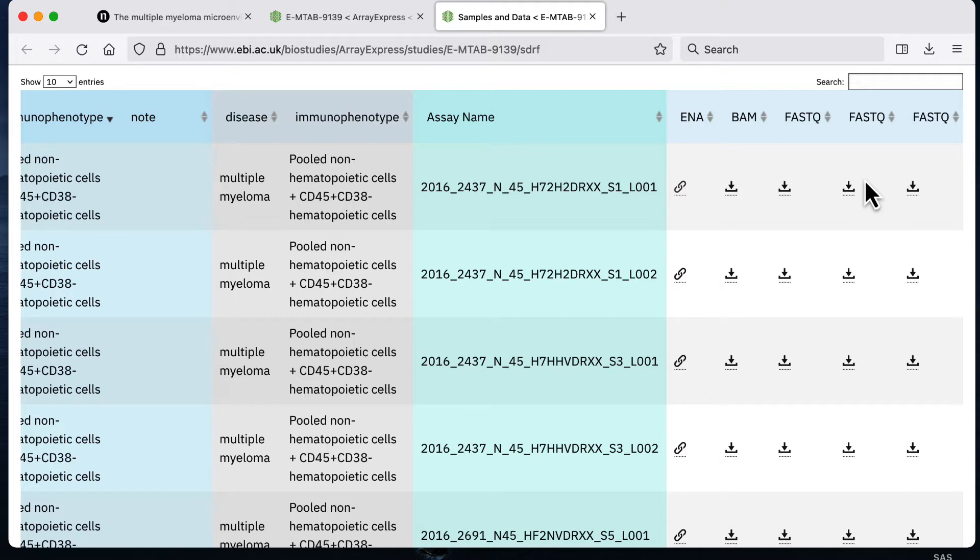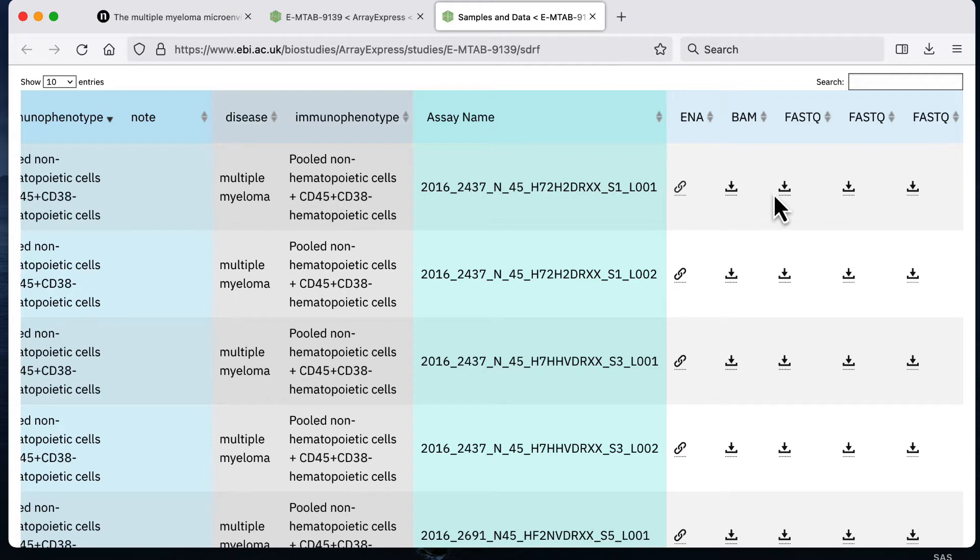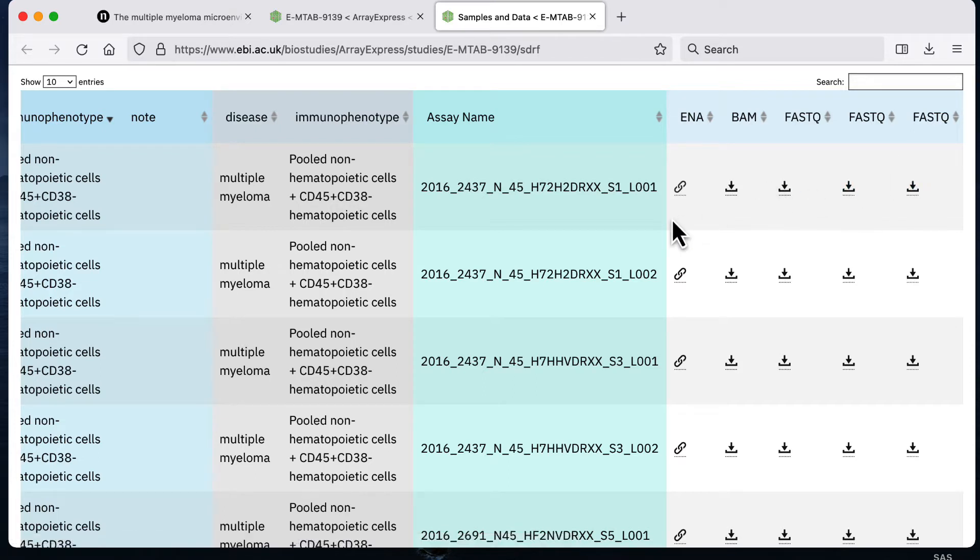There are two possible ways that you might want to analyze single cell RNA-seq data. Maybe you want to download the raw data, in other words the FASTQ files, to a local machine in which case you can just use the graphic user interface to click and download the data to a local machine.